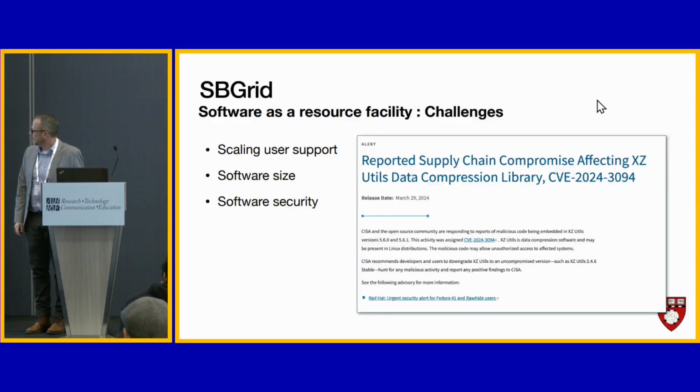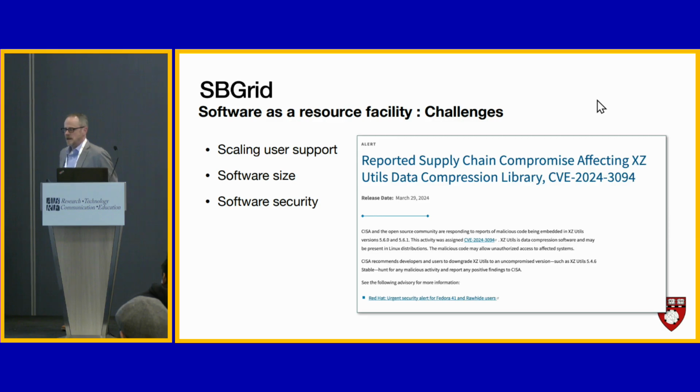And then I just want to highlight a couple of challenges we face. 520 labs is a lot, so we're working to scale user support. We just added 2 more staff members with some cryo-EM backgrounds, so that's going to help. One of them is one of the developers of a package called Scipion, which is this massive package out of Spain that is like a little mini SBGrid, so it seems like a really natural fit to have somebody who has worked in that environment, so I'm excited.